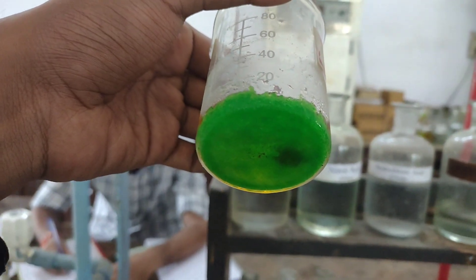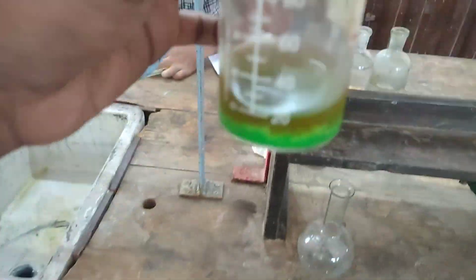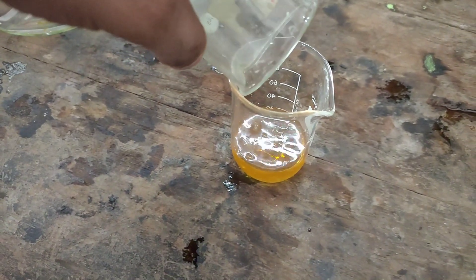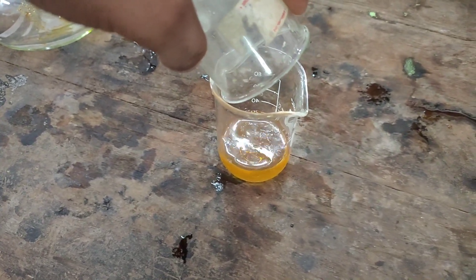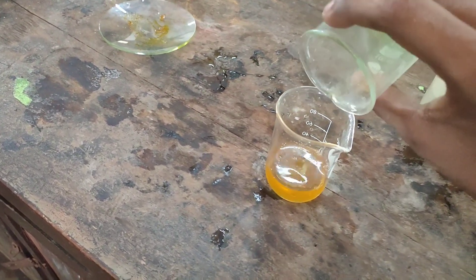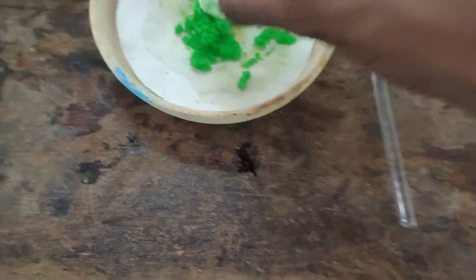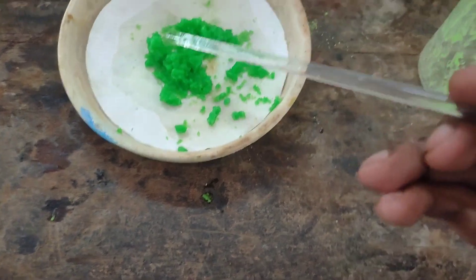On cooling, green crystals of potassium trioxalato ferrite 3 trihydrate separate out. The mother liquor was decanted off into another beaker. These crystals were then washed with some distilled water, and then taken out onto a filter paper placed on a porous plate to absorb the excess water.